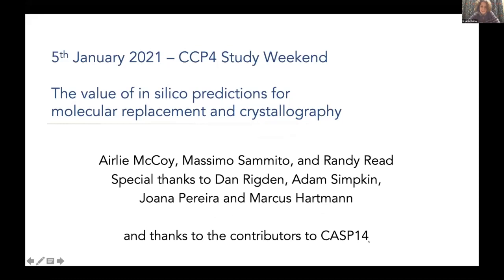So I was given this topic by the organisers back in September: the value of in silico predictions for molecular replacement and crystallography. And at the time, the topic was far less high profile than it is now. So it's been a very interesting talk to put together, actually.